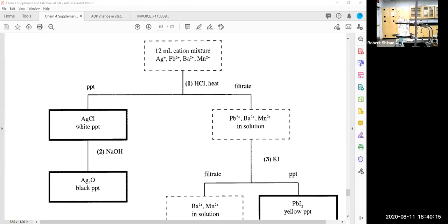Okay, and then since this is pretty full, and since we're running out of glassware, I'm going to use an Erlenmeyer to filter it in here. So let me wet the filter paper. Dump out the excess. And then let's go ahead and filter this one. So it looks like a lot of the white PPT did not dissolve here.